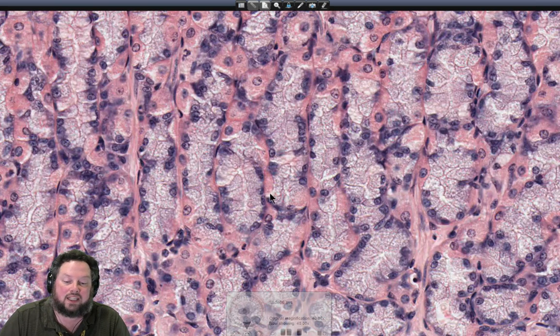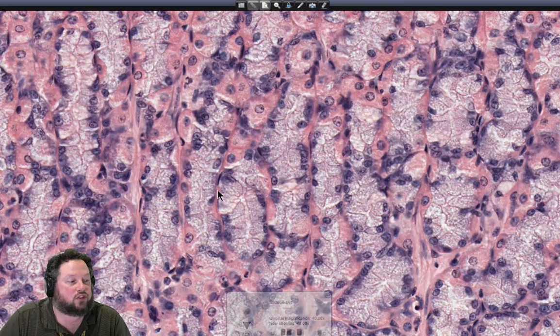But it's likely that whichever animal this was taken from had a meal relatively recently, and probably a lot of these granules have been exocytosed. So they're relatively pale staining, but it does give a general overview of basophilia.